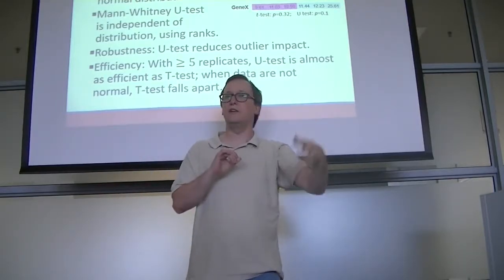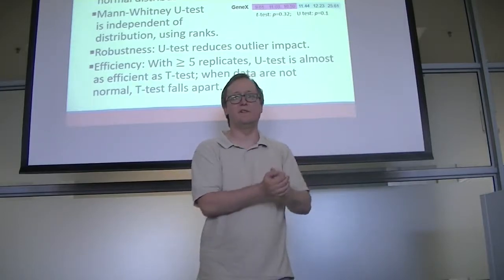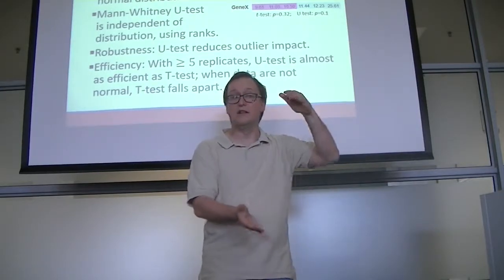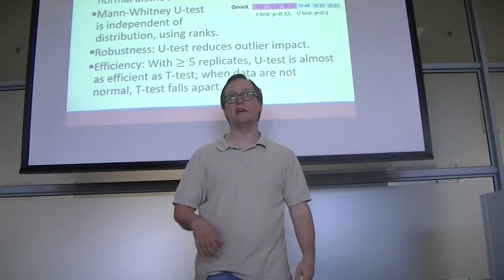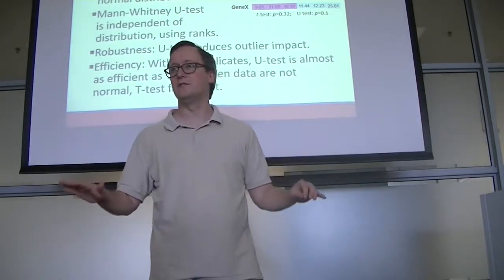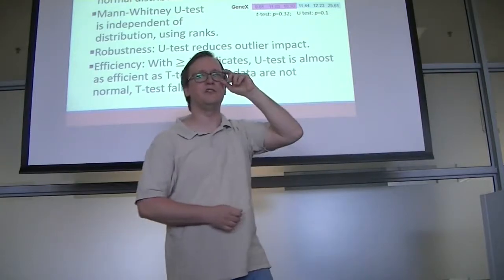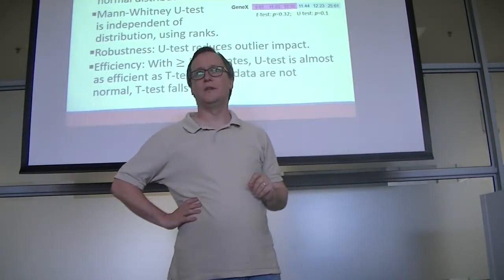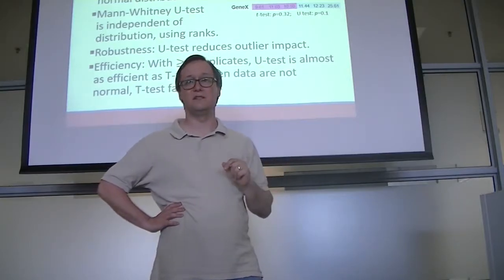So just one value changed within the expressions, but that change was enough to boost variance, and thus the p-value rose, taking it from something that looked like it was going to be significant but wasn't quite, to something that's clearly not a significant difference. All right, what happened to u-test under these same circumstances? U-test gave exactly the same p-value in both cases.